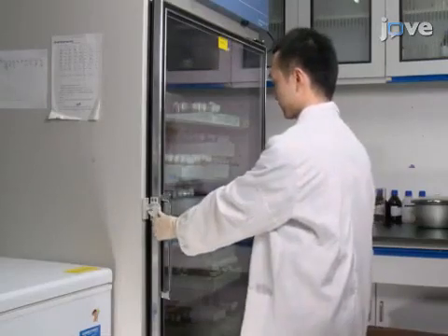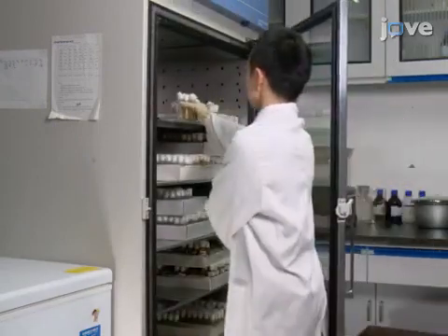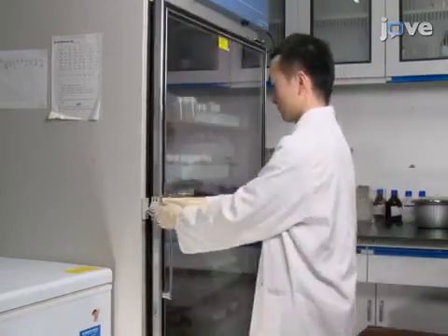To carry out fly collection, begin by maintaining the flies on standard fly food at 25 degrees Celsius, 70% humidity, and a 12-hour light, 12-hour dark cycle.